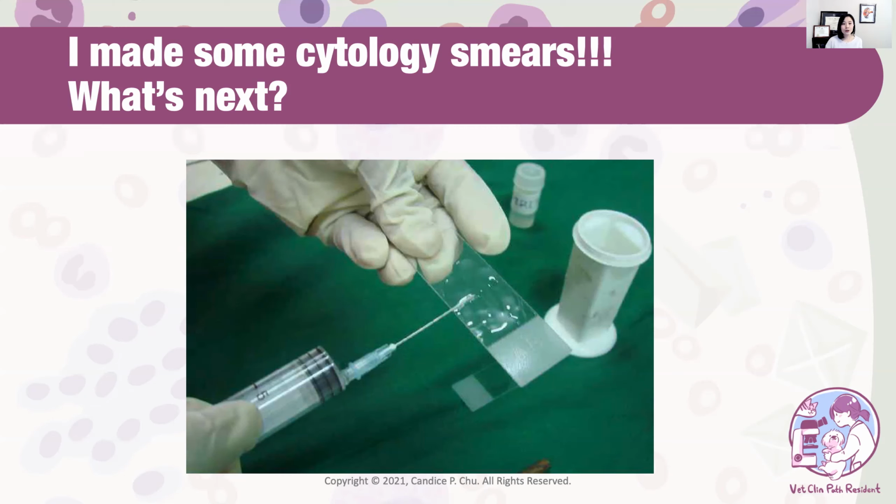And remember to stain just one of the smears, but not all of them, because pathologists do prefer our own stain in the lab. And even if we don't like your Diff-Quik stain, sometimes we can restain it, but it is better that you submit unstained slides as well.